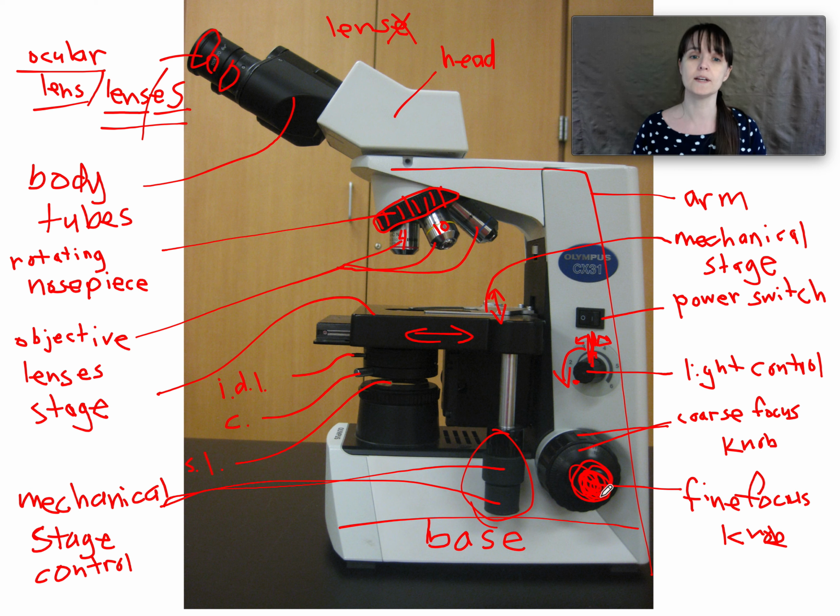So always start with the stage all the way down and the red low-powered objective lens forward, which is this position. So this gives you the most space. The blue one comes down quite a bit lower, and you have a whole lot less space to move that fragile little glass thing.